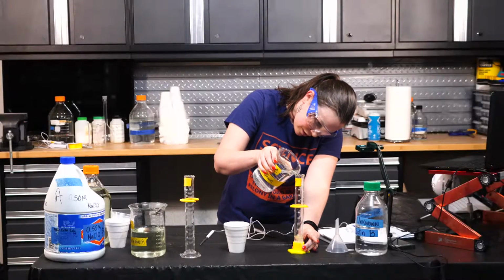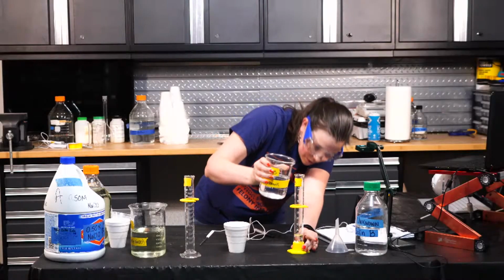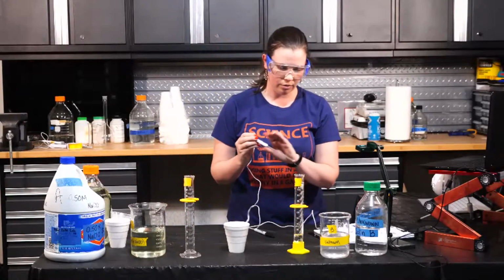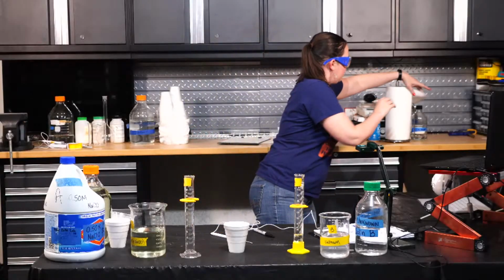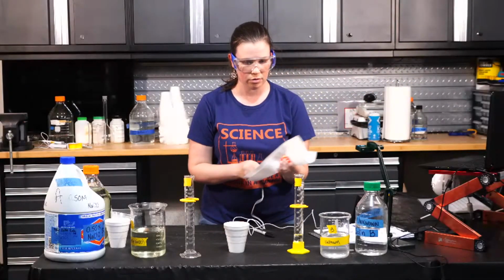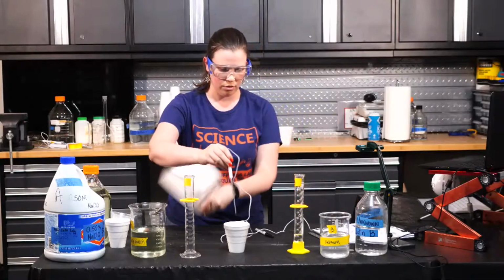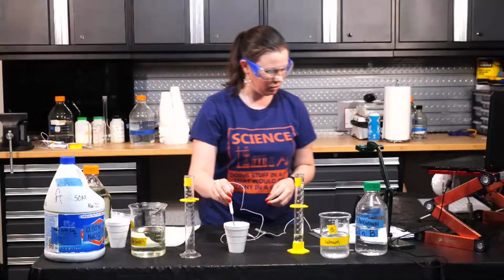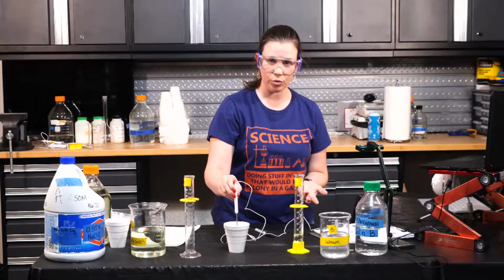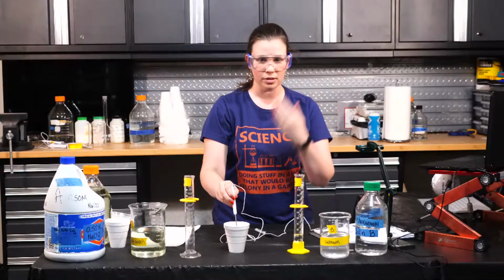Notice how I have everything in completely separate labeled containers to avoid cross-contamination. All right, so now I'm going to grab a little paper towel and wipe off my thermometer, so there's no cross-contamination there either. And I'm going to get the initial temperature of the mixture here. And big surprise, we are at 19.0, the same initial temperature from before. So now I'm going to add solution B and see what the temperature change might be.